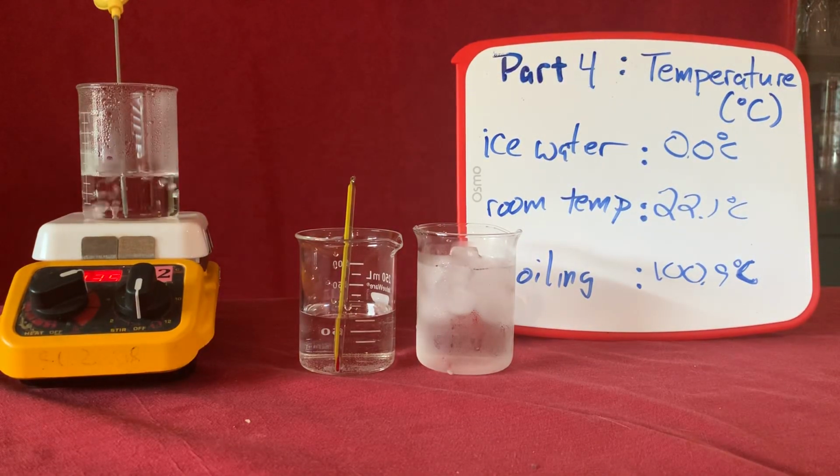So here we have our 3 different measurements. With the digital thermometer, we just record all the numbers that are on the screen. With the analog thermometer, we measure it just like we measure our other volumetric readings.